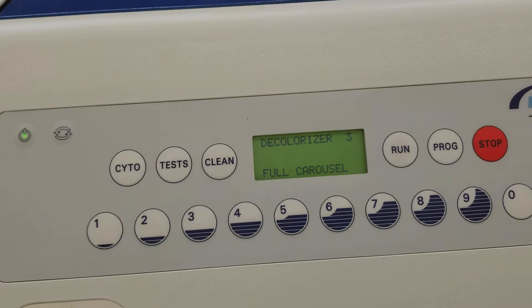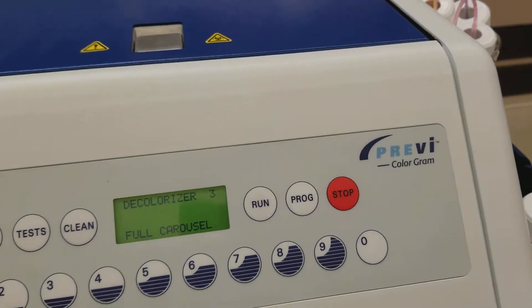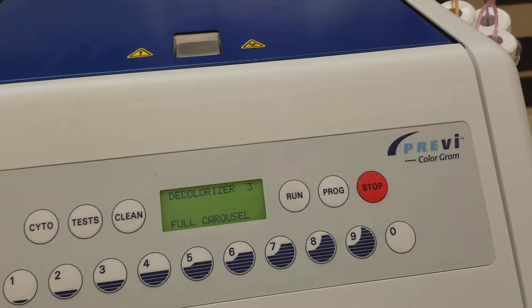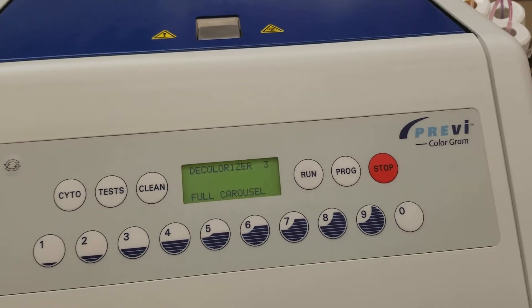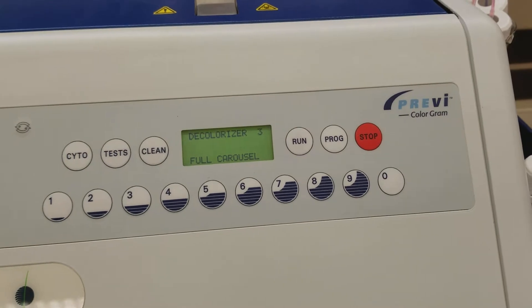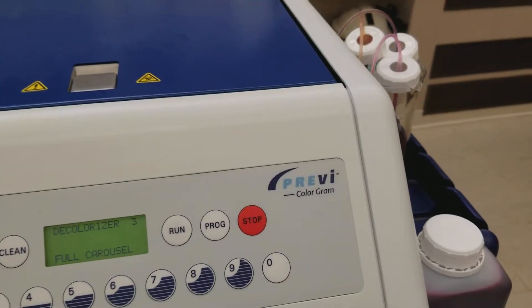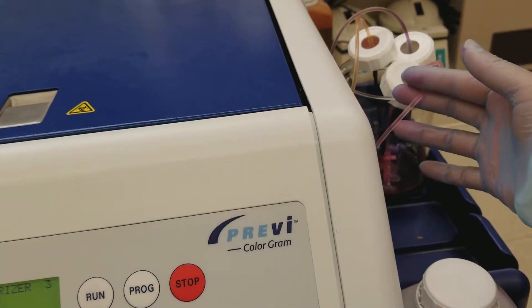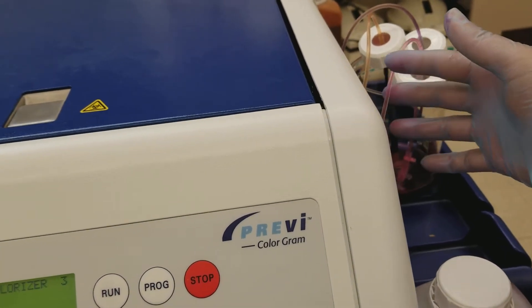So between classes, this would be the thing that we would do until that class runs again in another semester or whatever. If it's going to be longer than a week or so, you should be doing this so that you don't get any deposition or clogging of the stain in your lines.